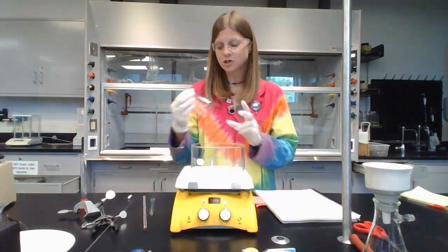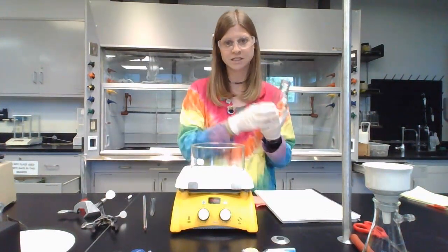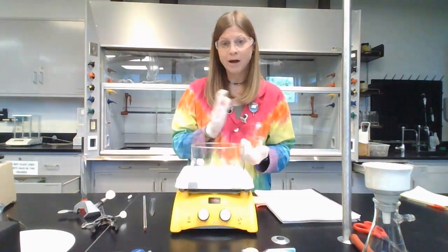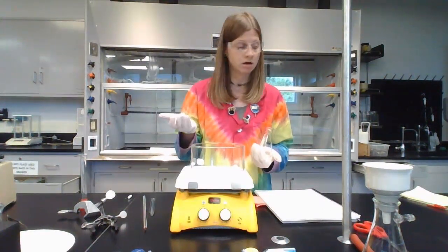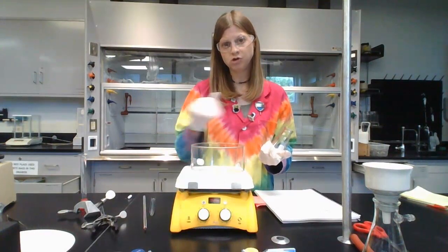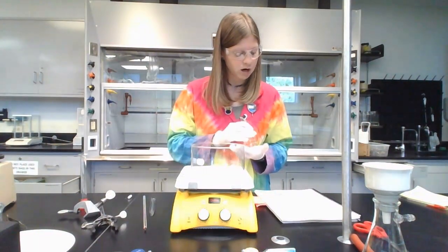So we're going to start our reaction, and it's going to happen inside of a 125 milliliter Erlenmeyer flask. This is smaller than the Erlenmeyer flasks you used to do your acid-base titration earlier in the semester. So you're going to measure out about 3 grams of this starting material, salicylic acid, which is a white solid. You're going to measure it using weigh paper. Now it says about 3 grams, but you do need to accurately record the mass in your lab. It's going to be important because we're going to be calculating the theoretical yield from things like that. So about 3 grams.